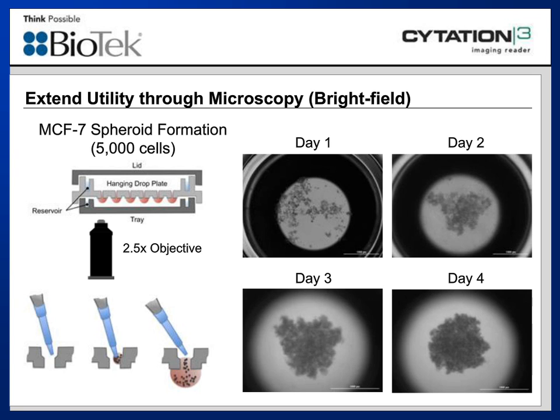And the optimum Z height was obtained using manual image mode to determine the height where the largest number of cells were in focus. This can be performed using bright field imaging for unlabeled cells or using fluorescence for labeled cells. And the height can then be used for automated imaging of the entire plate once that is established.